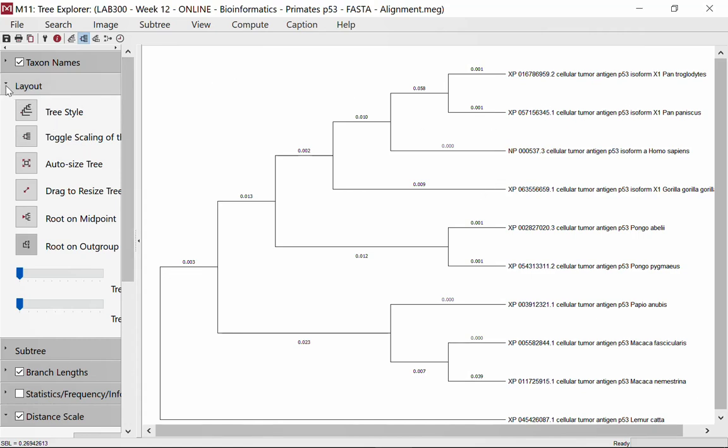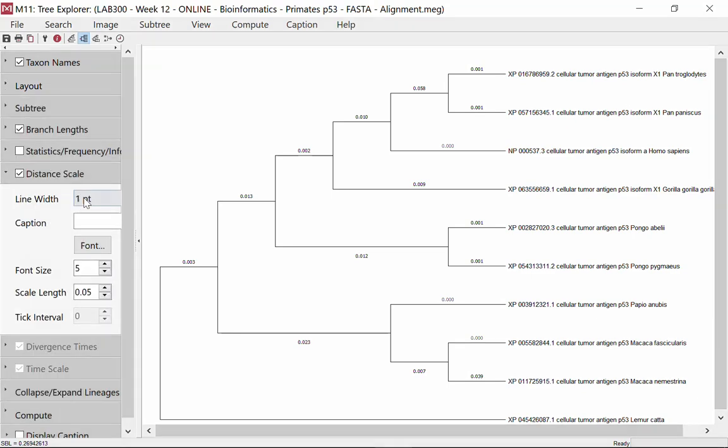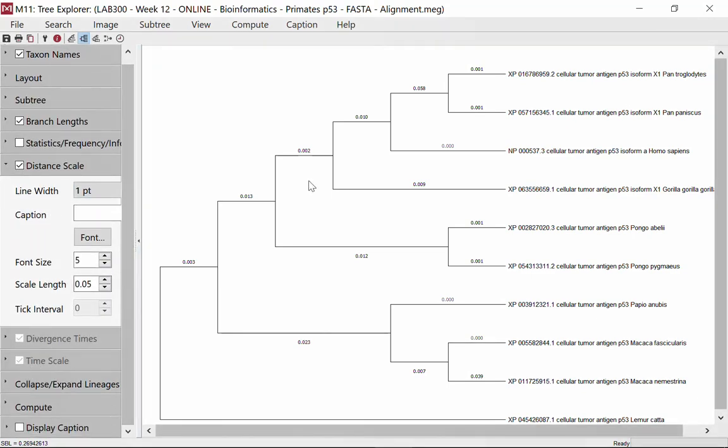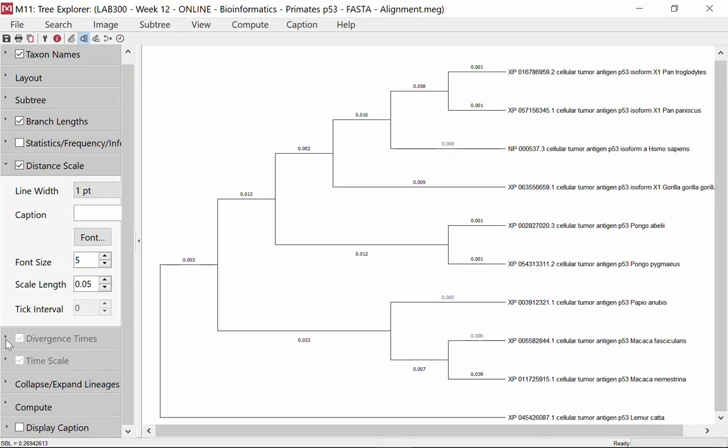Another thing, sorry, that you can play with here is the graphic part. What you have to do, ultimately, keep in mind, you have to screenshot these and add them to your assignment for both the P53 and the mitochondrial DNA, again, with the additional sequence that was assigned specifically to your group.